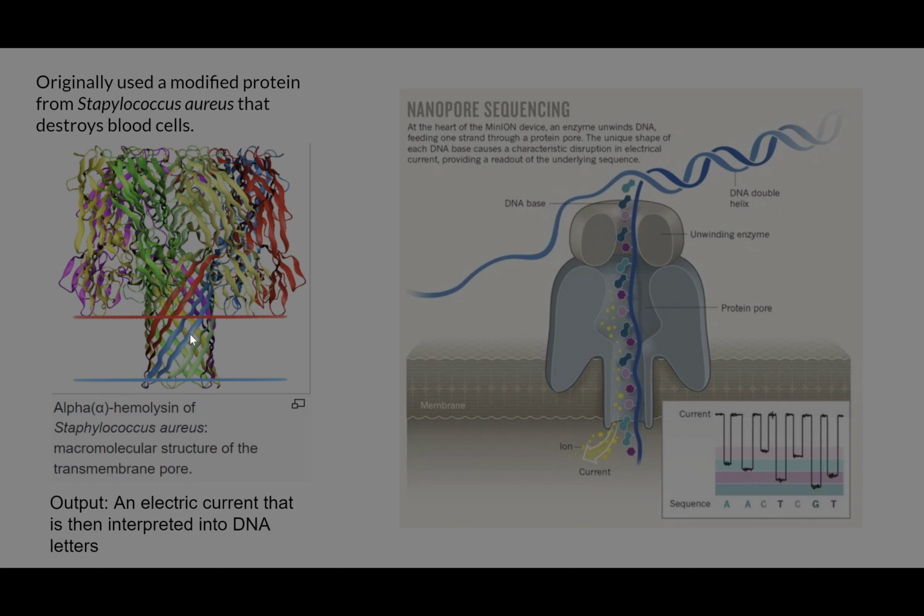contents out. But someone was really thinking pretty hard about this and realized the dimension of this tube in the middle of this protein, this is a two-dimensional representation, here's a better sort of 3D look at it. It's an actual pore here. It's about the same size as a single strand of DNA. So that DNA that's been separated into two strands.